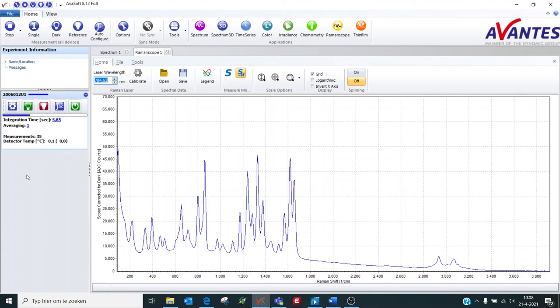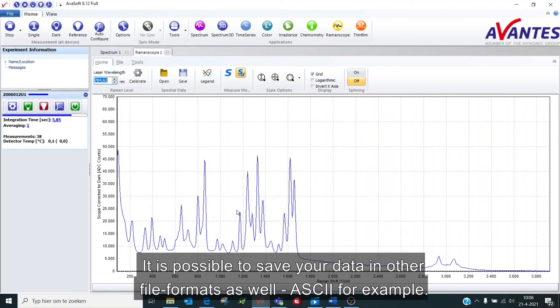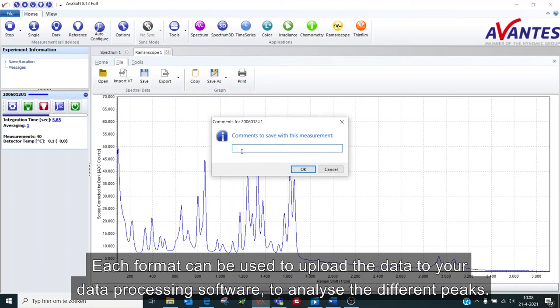After finishing your measurement, you can save the data on your computer. It is possible to save your data in other file formats as well, ASCII for example. Each format can be used to upload the data to your data processing software to analyze the different peaks.